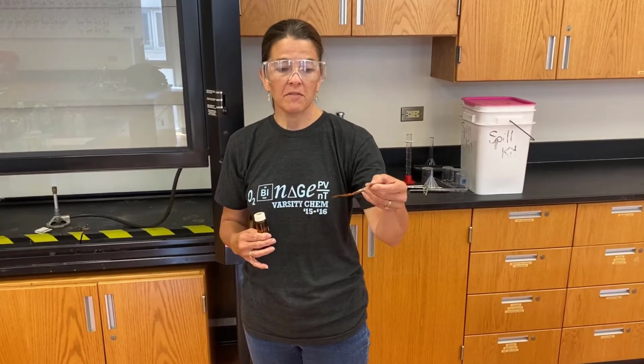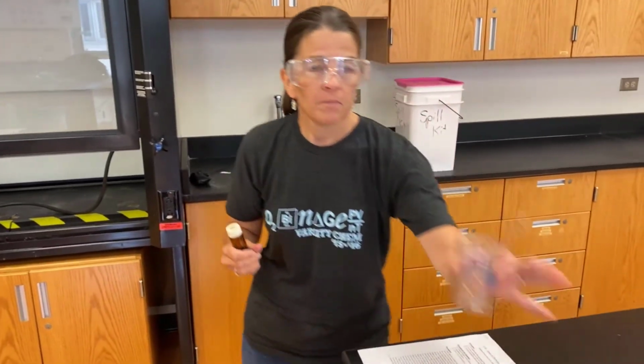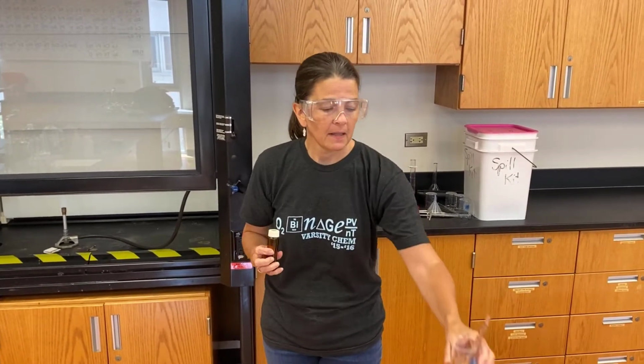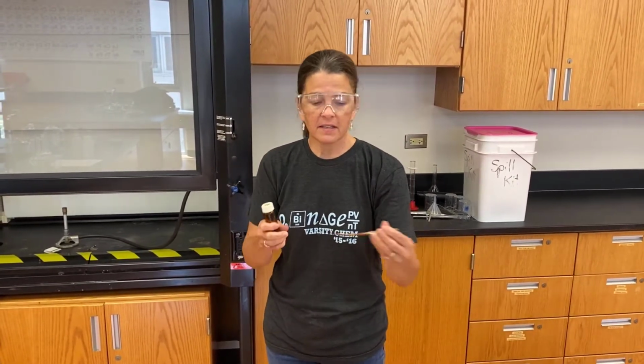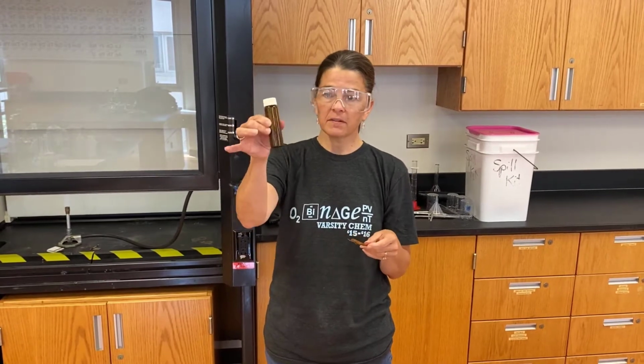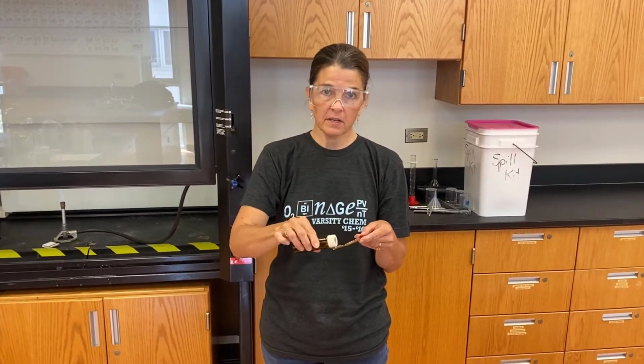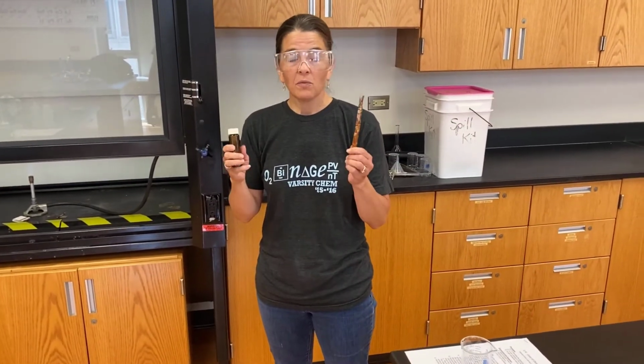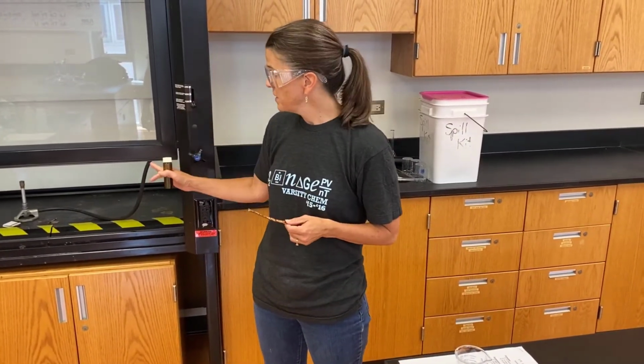So the basic process for this lab will be, I'm going to start with a piece of copper. You will have the mass of this piece of copper sitting in a beaker, because that's the easiest way to measure it, so you'll have a mass of this item. Then I'm going to put a little bit of solid iodine on the end of it, and I'm going to hold it into a burner flame. Okay, so we're going to put it into the burner flame.